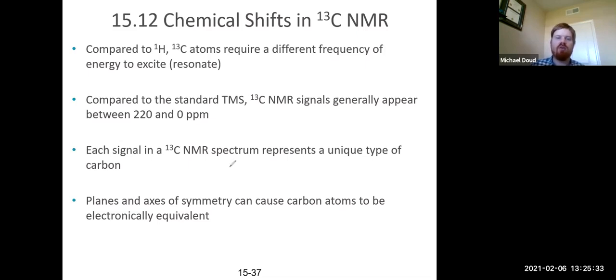Now, on the other hand, if you had a substituted benzene, like let's say that we had phenol. Now that's going to throw things off, right? If we look for symmetry now, what we're going to see is that there's a symmetry here, but that's it.